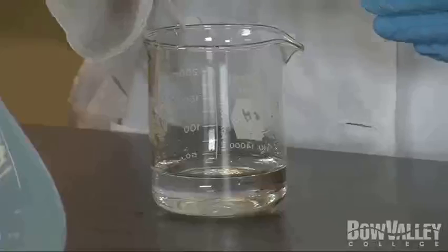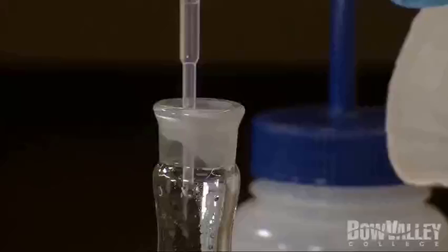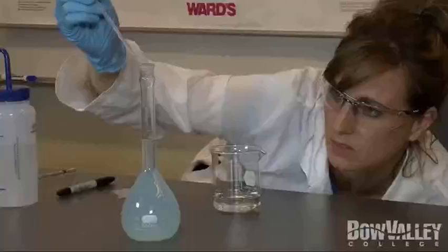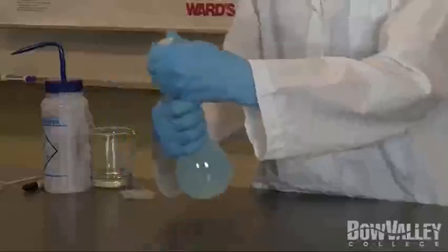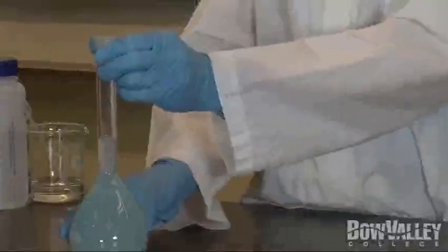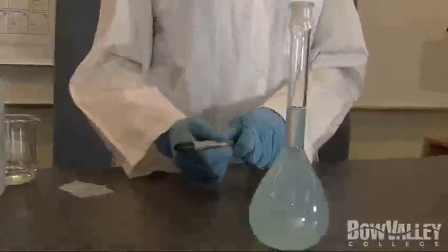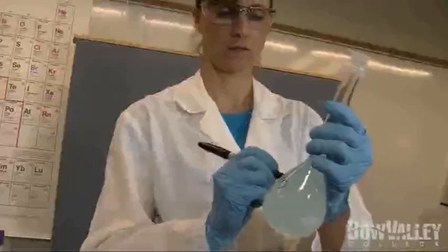Monitoring the level and using a disposable pipette for the last few drops. Once again, the bottom of the meniscus should be sitting on top of the line marked on the neck of the flask. Seal the flask with parafilm and gently invert to mix thoroughly. Label your flask. Your diluted solution is now ready for use.